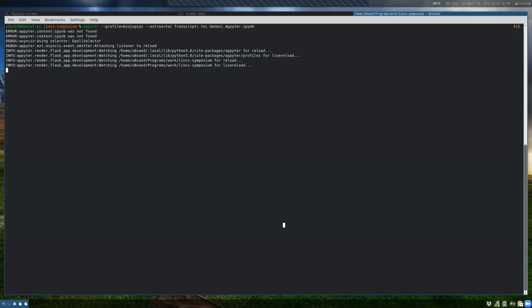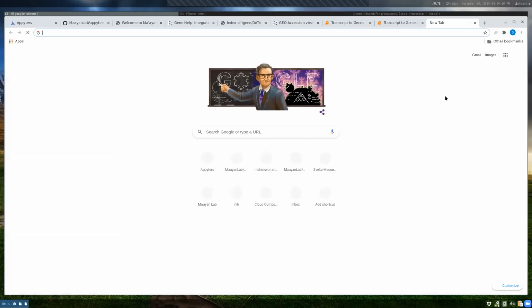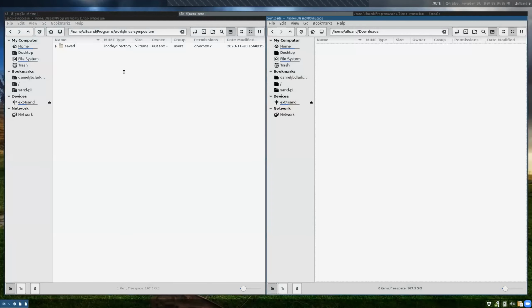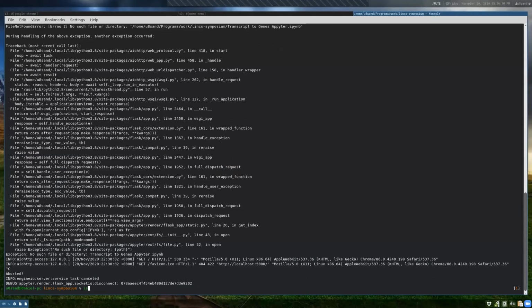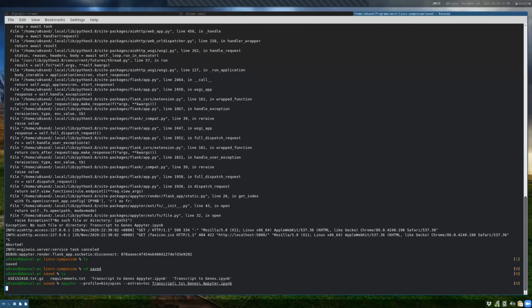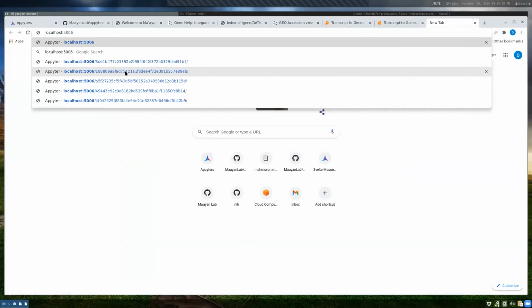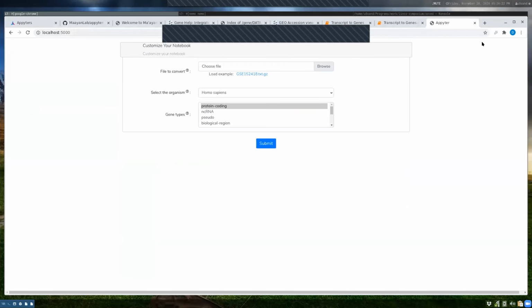Transcripts genes, looks good. Sorry, I'm trying to rush too. In the wrong directory. They did give us 10 more minutes, so we will get cut off. We'll get cut off at 5:45 exactly.